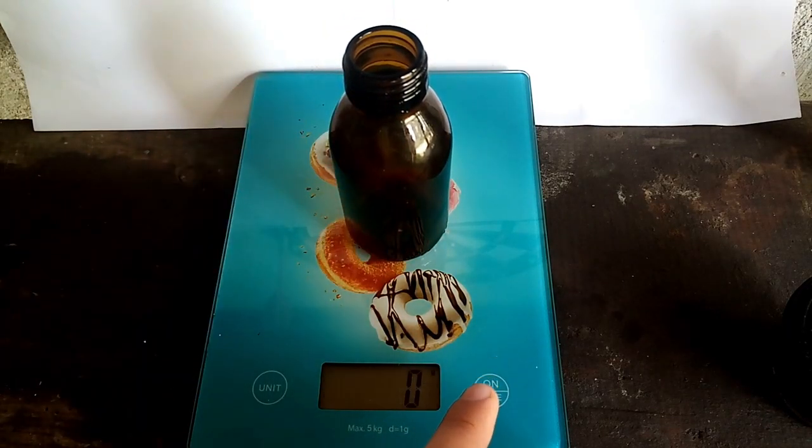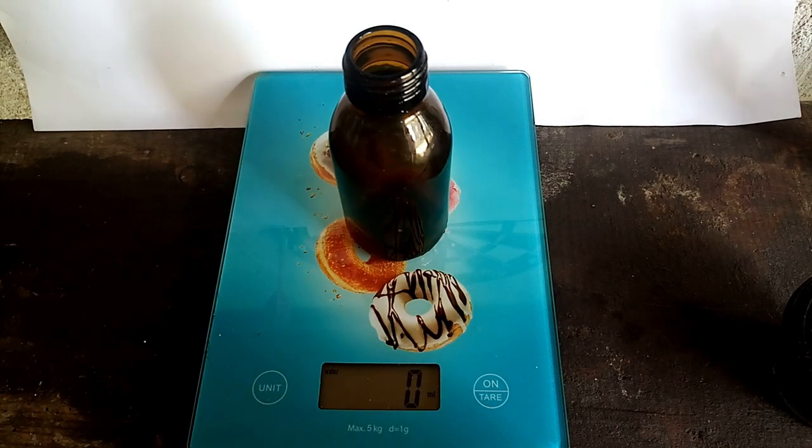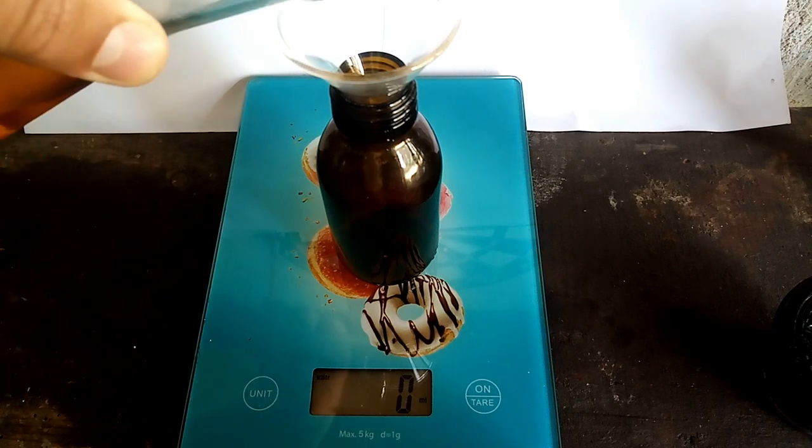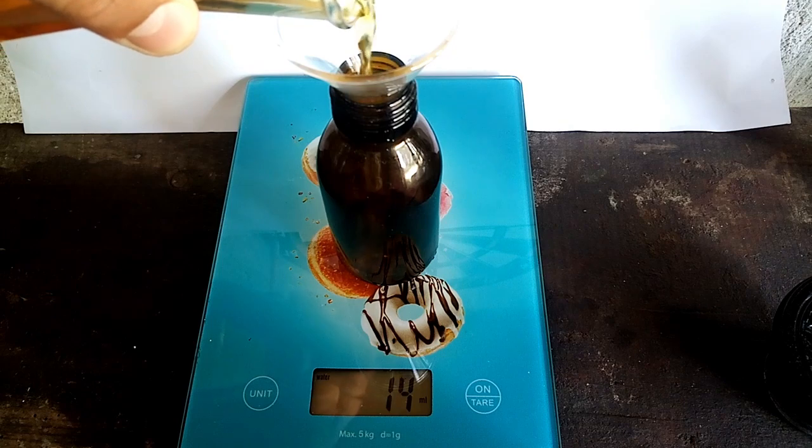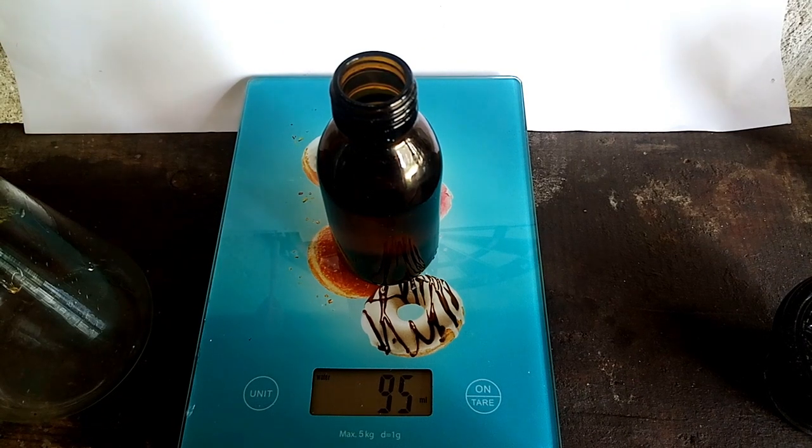It's time to see how much acid I made. From my calculations, the acid concentration is about 35% with a yield of 96 milliliters.